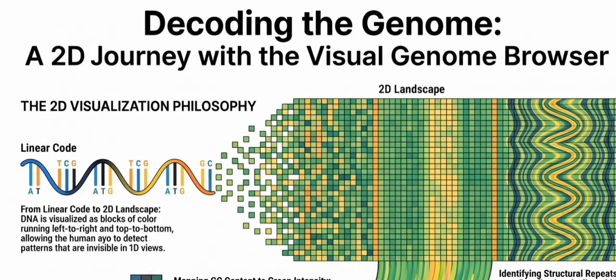And I noticed there is an auto-detect function. If I just paste a sequence like ATCG, the software knows it's DNA. But if I paste a sequence that starts with an M, methionine, the amino acid that acts as the start signal for proteins, the software intuitively recognizes the amino acid alphabet and dynamically adjusts its search parameters. It's smart enough to know what language you are speaking, basically.